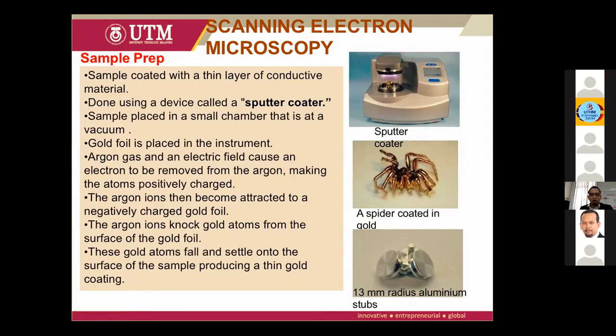And the placement of the sample also is important. If you place a good thin-layered or very fine sample, you're going to have a good image. But if you just spray it, it wouldn't give a good image, it wouldn't work. Okay, so the sample preparation is a bit tricky here. And usually those who are really familiar and experienced in this preparation know how much of the sample is required or used to give you a good micrograph image.